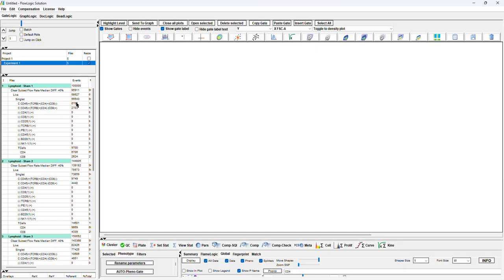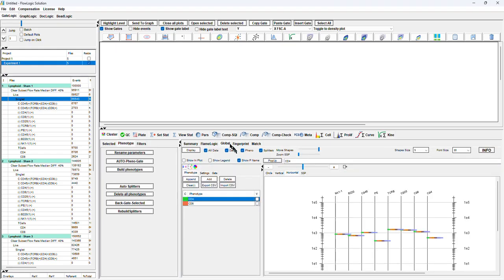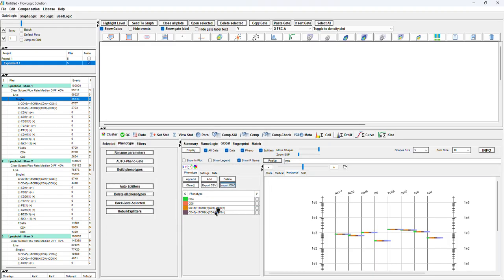And you can see immediately this is our extraction. So if we want to visualize the clusters, these are all the clusters with the phenotype attached, and you can see how useful it is having very short phenotypes. And if we want to see the cluster, we import the CSV script that we used, which is very simple, CD4 and CD8, and then we display, and here you can see all the clusters.